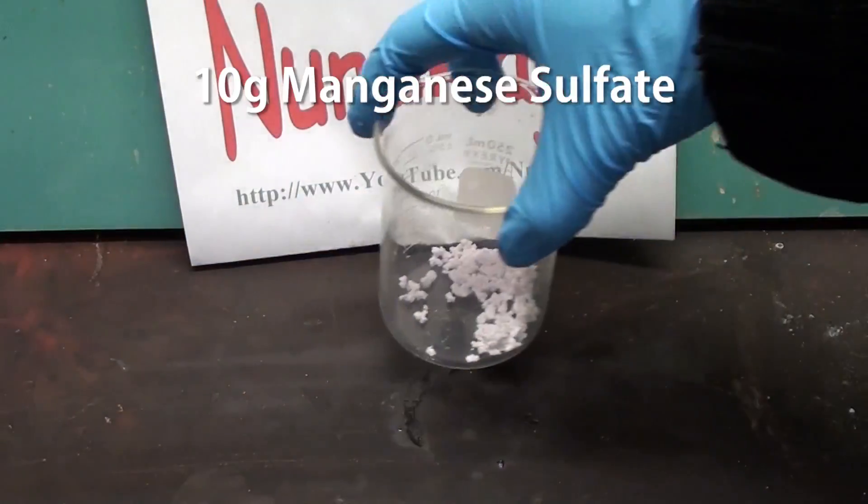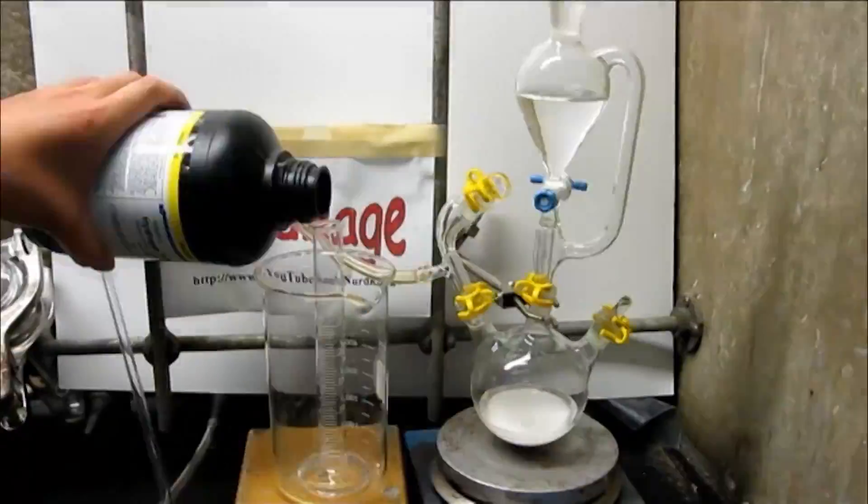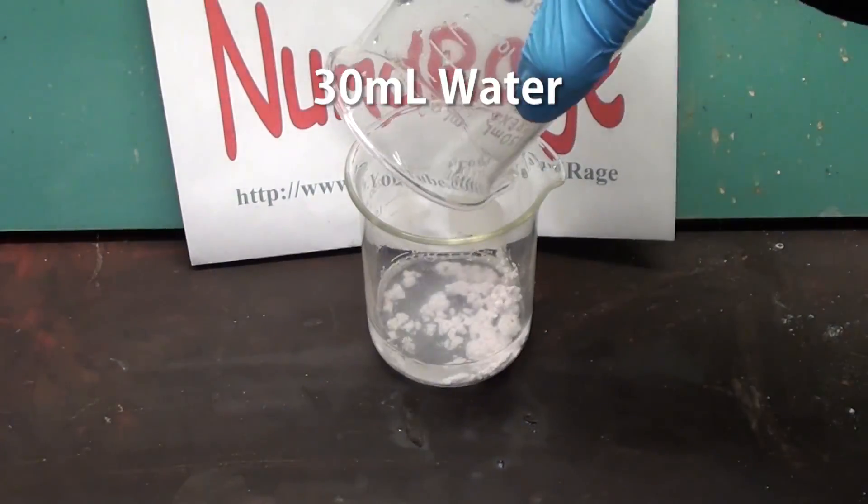First, take about 10g of manganese sulfate. This can be bought as a specialized fertilizer or made from crude manganese dioxide as shown in a previous video. Add in 30mL of water and shake until dissolved.